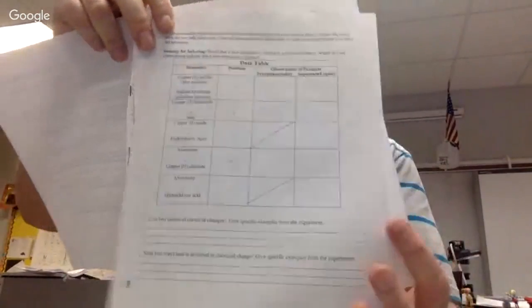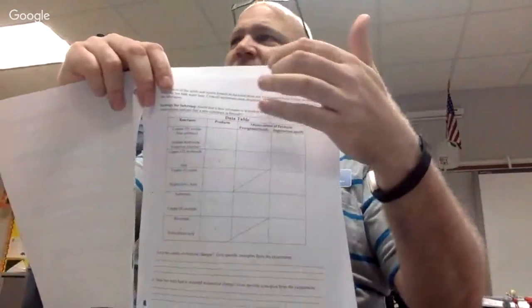Now, page 3 is where you're going to be including a lot of your observations. And if you notice here, there is a category that says products, and then it says precipitate and supernate. So precipitate is a fancy way of saying solid. Supernate is a fancy way of saying liquid. You're going to describe what you see in the lab when you mix things together first in these spaces right here.